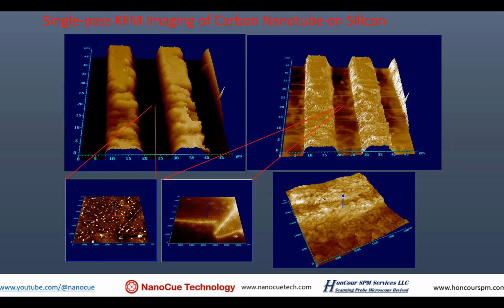Okay. And stainless steel is another thing people love to use with KFM. If you polish the surface, you have grains, and these grains exposed to different humidity, the electrochemical reactions cause the surface to have different patches of potential. That's another thing. It's not a substrate anymore. It is a sample I like to study. It's stainless steel inside some kind of humidity. You can see very interesting signals. People like to look at that for corrosion. Correct. Yes, corrosion.